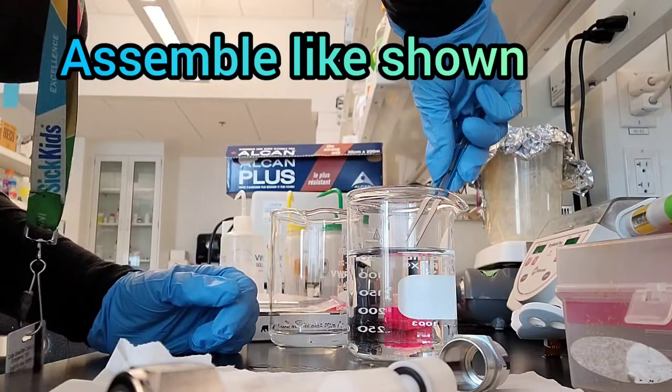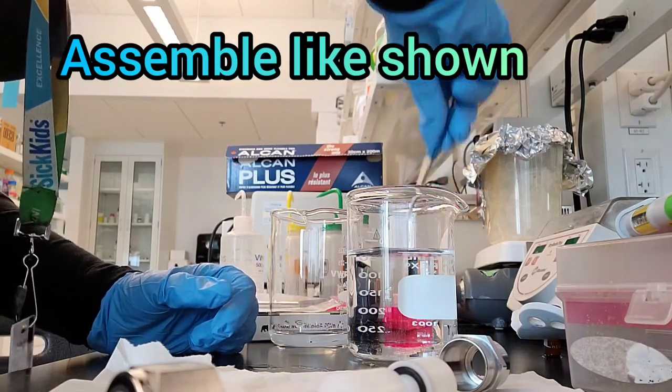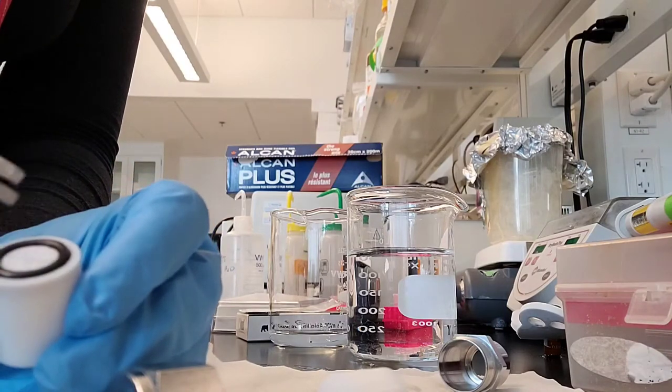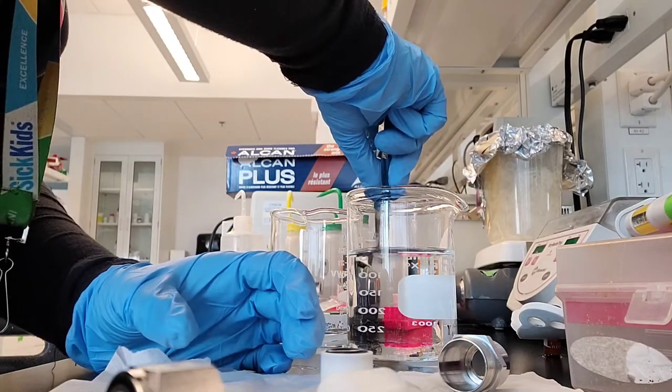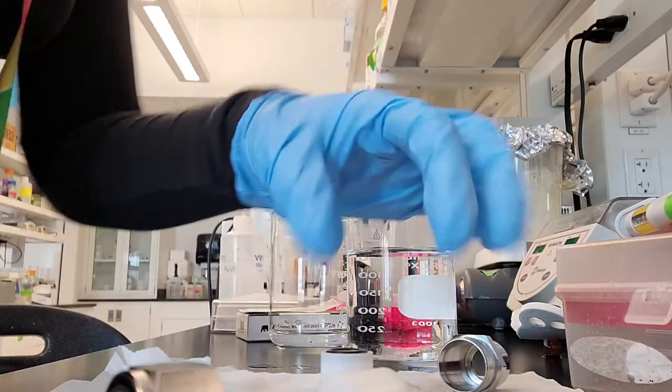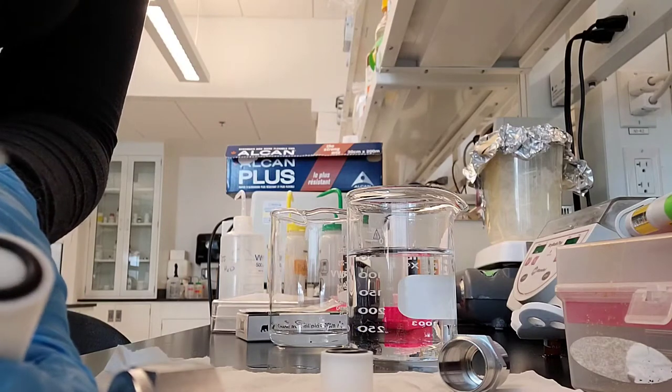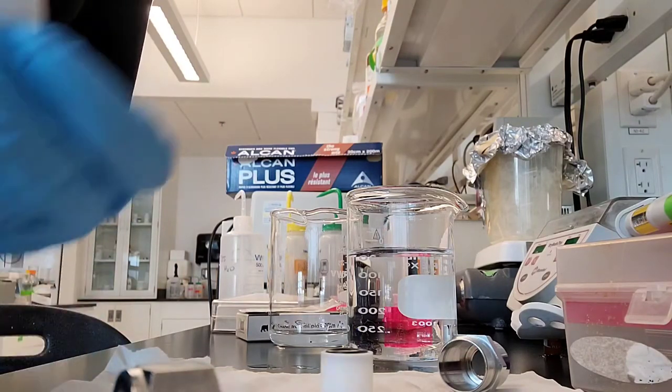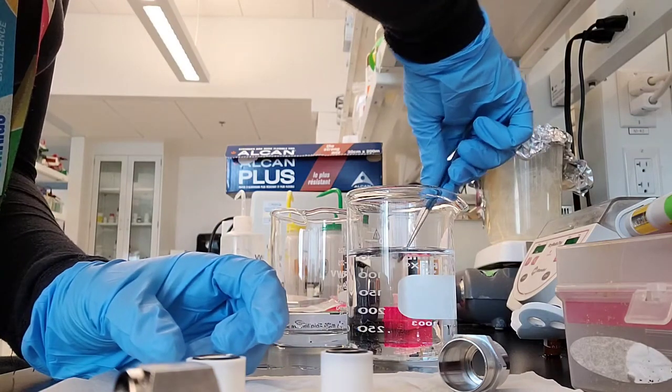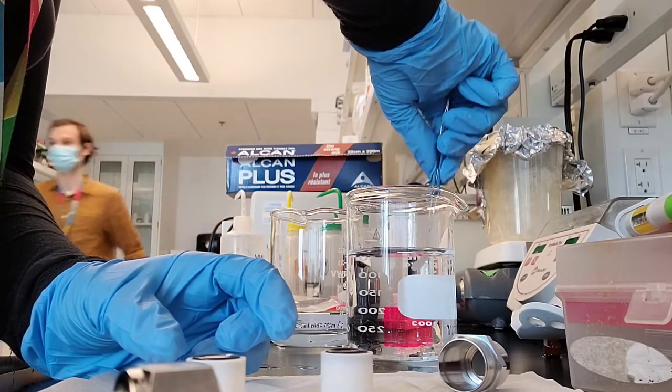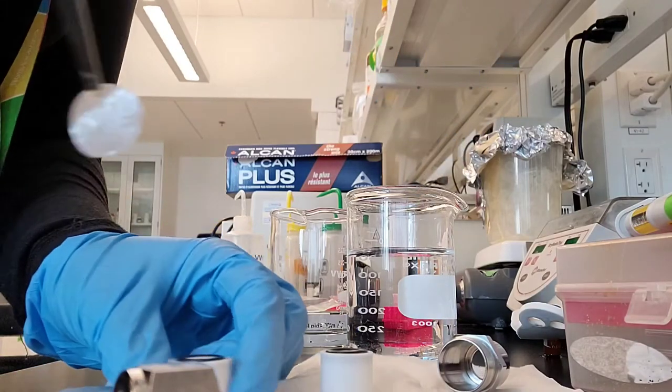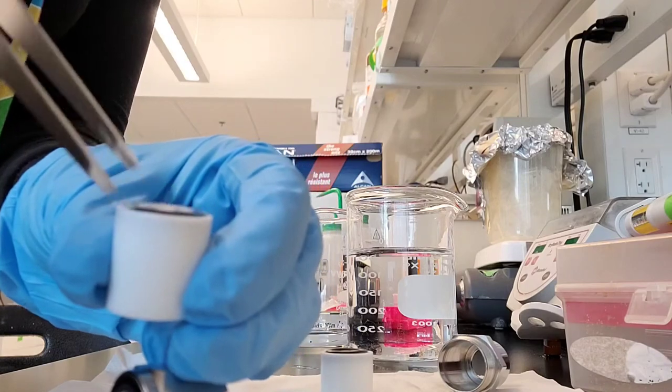The phase transition temperature from gel to liquid for these lipids is around room temperature, so I make sure my plate is about 40 degrees at least so the extrusion will happen smoothly. Then I assemble everything.